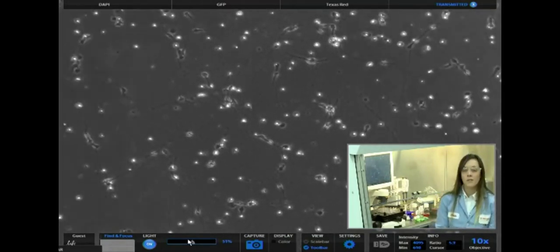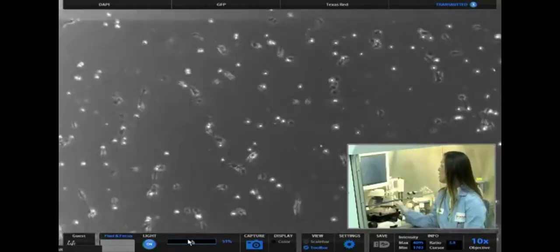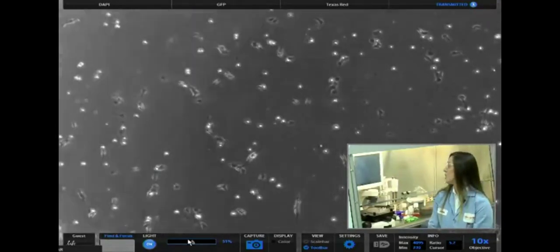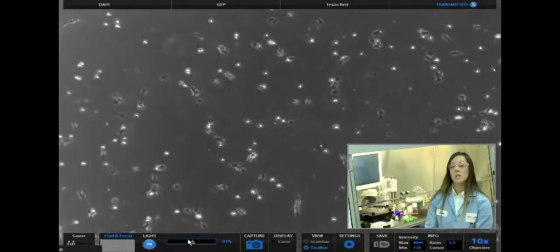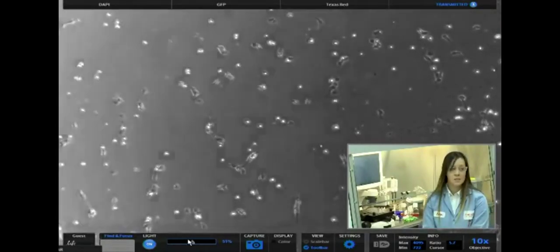And then also, after you do your bright field photos, you want to do some QC, which is a good thing to do when you're making neurons for the first time. So I actually have a PowerPoint slide to show you guys right now of our neuronal QC.